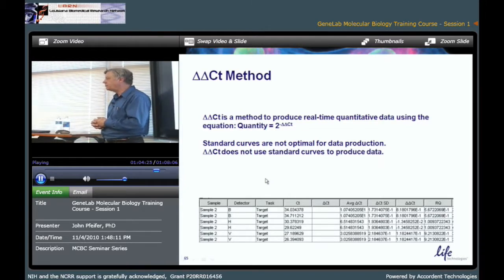Well, there's going to be a pipetting error there because you have to still put. Well, you're right. But that's why we do replicates. So if you do replicates, that'll help minimize that. We do the best we can, right?